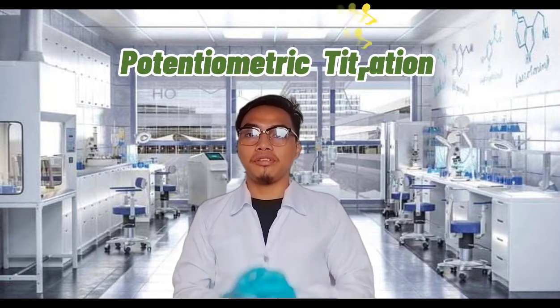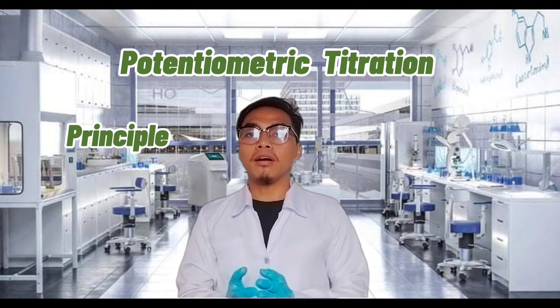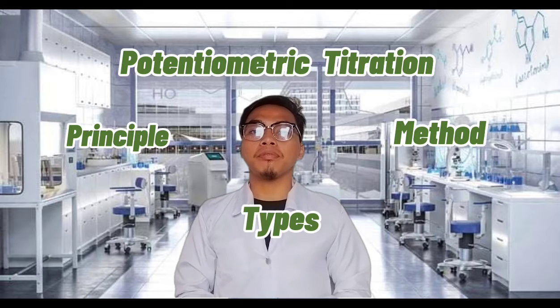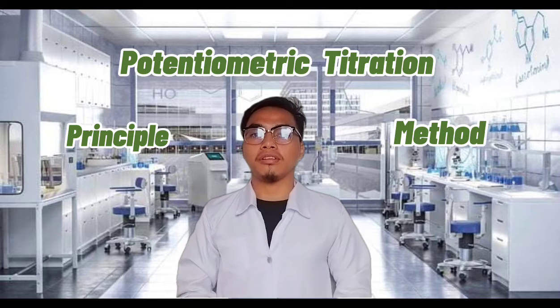Good day everyone, my name is Michael Martinez, and today we are going to tackle potentiometric titration: what is the principle of potentiometric titration, its method, and types of potentiometric titration.